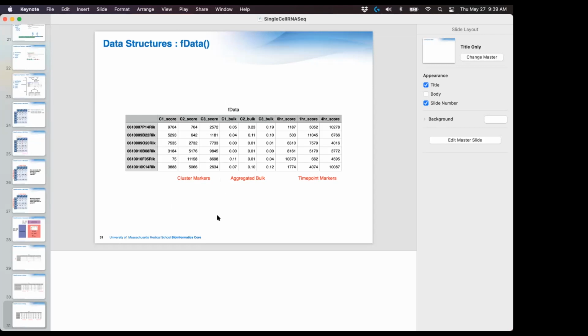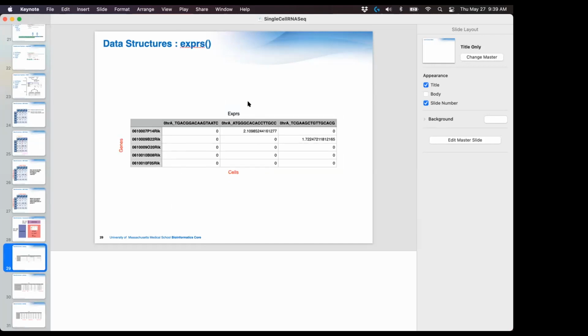sensitivity is much less. If you think about the UMI matrix we were looking at, like 95% of the values in this matrix are 0. In a single cell, you might detect 200 to 400 genes, but in reality, a single cell is going to be expressing at least 1,000 genes, maybe 5,000 different genes. So you have a sensitivity issue where in each individual single cell, you might not see a transcript, but that doesn't mean it wasn't expressed. It might just mean you did not capture that transcript.